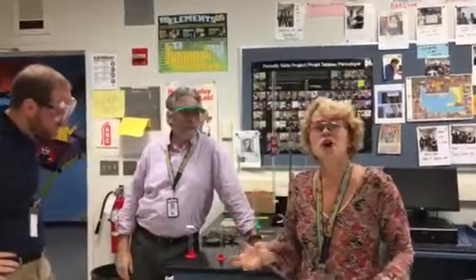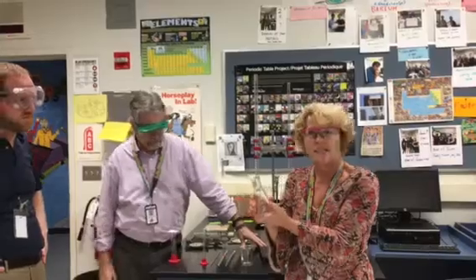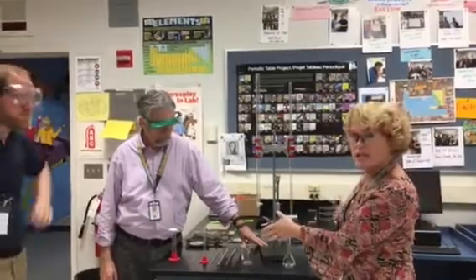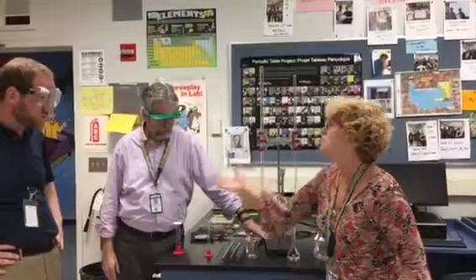Okay, and today we're going to talk about measurement and sig figs. The reason we talk about significant figures is because we're limited by the measuring device, correct? Yes. So we're going to take different measuring instruments and talk about the number of significant figures you can get from them. Steve, you want to go first?